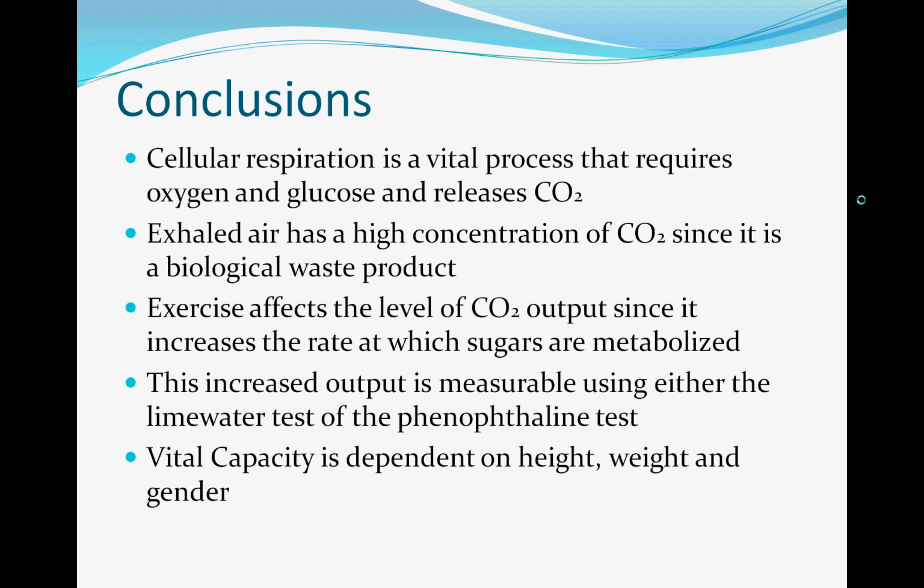So from the lab, a couple conclusions can be made. We concluded that cellular respiration is a vital process, and it requires oxygen as well as glucose, and ultimately the byproduct is CO2. Exhaled air has a high concentration of CO2 since it is, once again, a biological waste product. Exercise affects the level of CO2 output since it increases the rate at which sugars are metabolized. This increased output is measurable, and as we did in this lab, it can be measured using lime water or phenolphthalein. And vital capacity appears that it is dependent on height, weight, and gender.